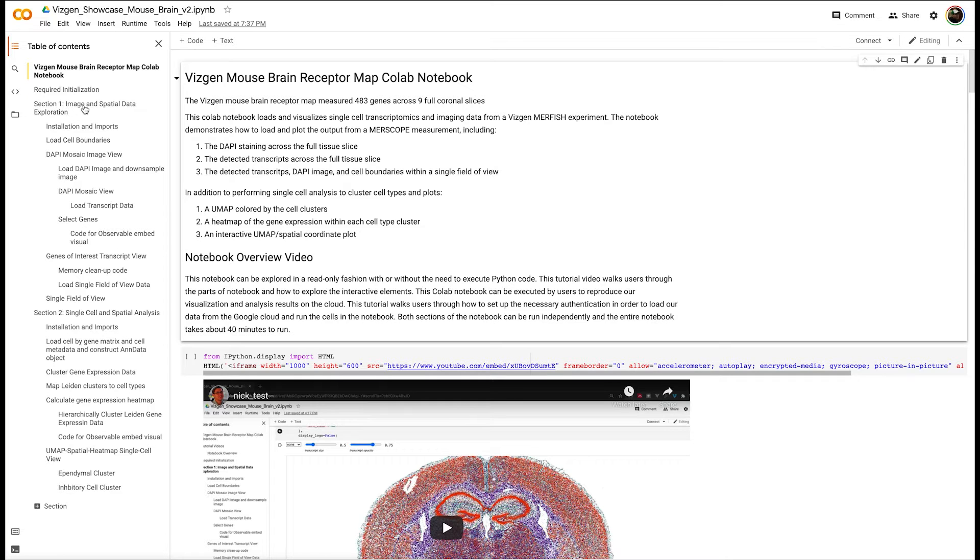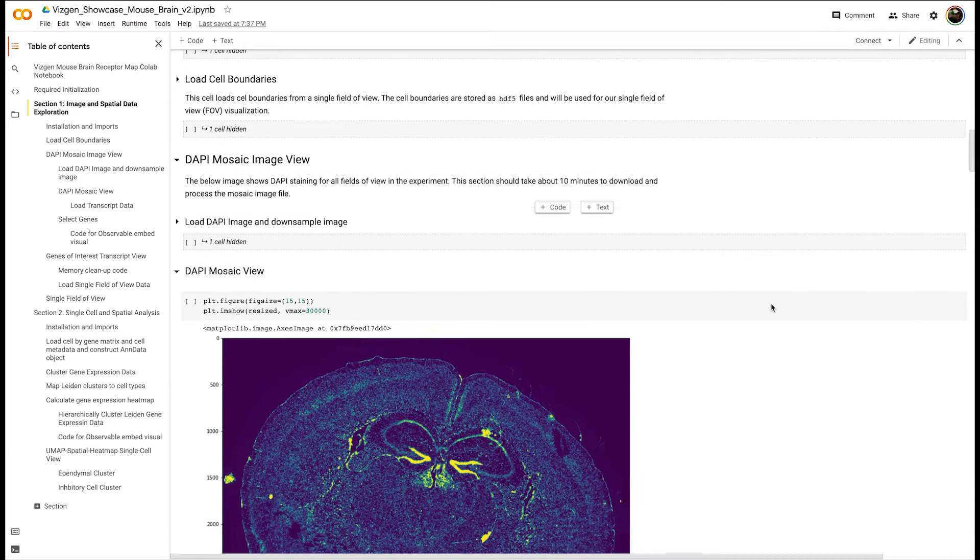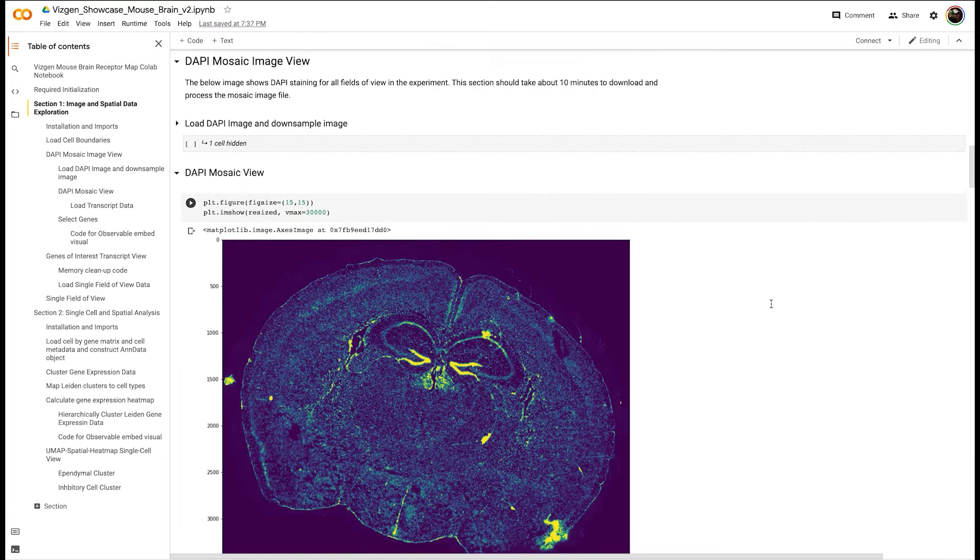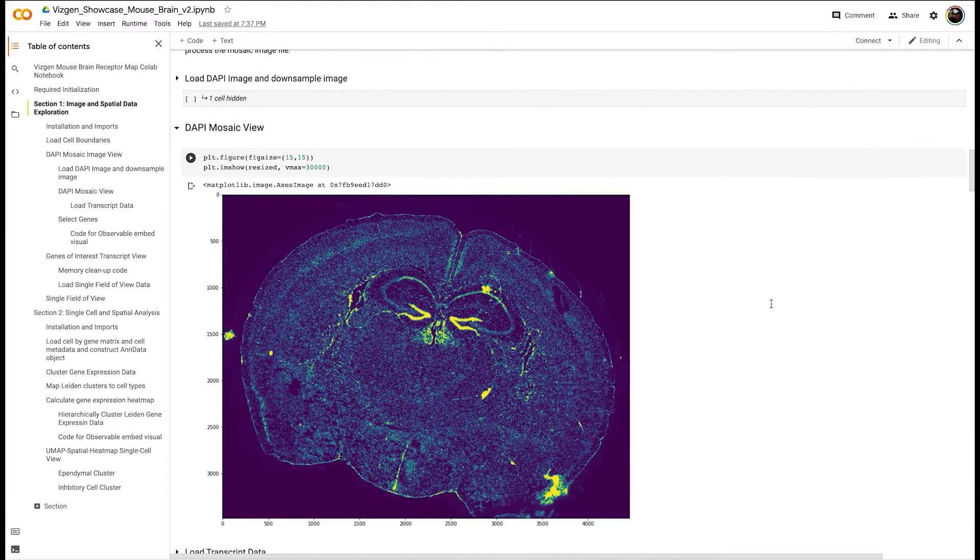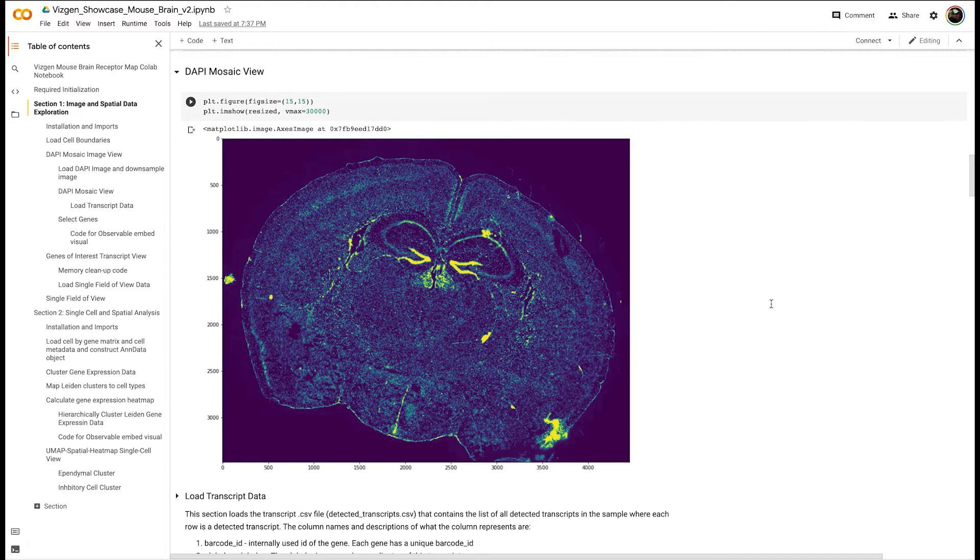Section one begins by downloading an image of the DAPI stain across our entire mouse brain. Here we're able to visualize individual nuclei across our entire tissue and get an idea of the number of cells we're able to measure within a single MERFISH run.